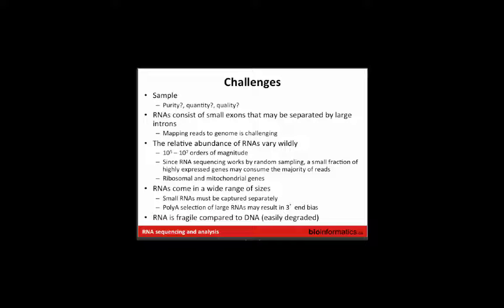And if your interest is in just annotating the transcriptome or just detecting presence or absence of certain transcripts, that might be a really good strategy because you can get broader coverage across the transcriptome without as much sequencing. The fear, the reason why people don't always want to do that, is that you'll lose information about how highly expressed each transcript is relative to other transcripts, or that you'll introduce bias. And that is a real concern.